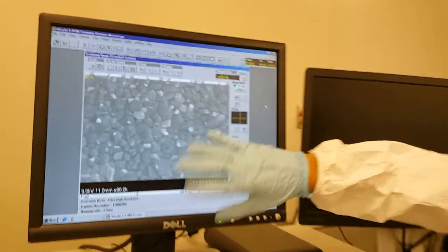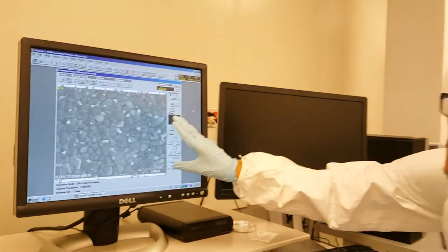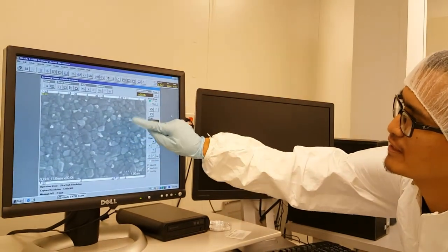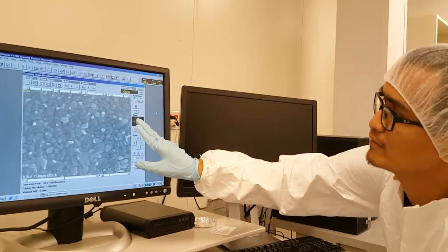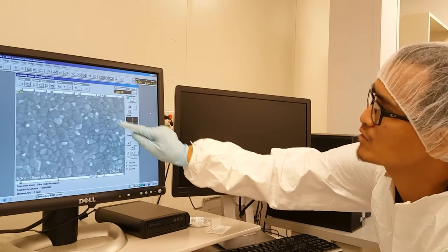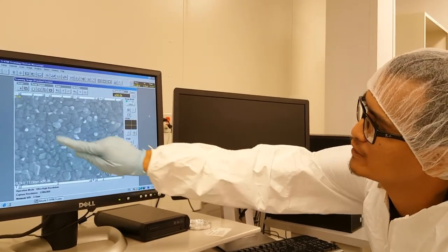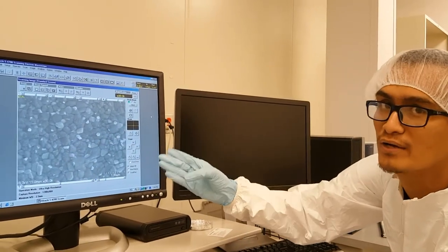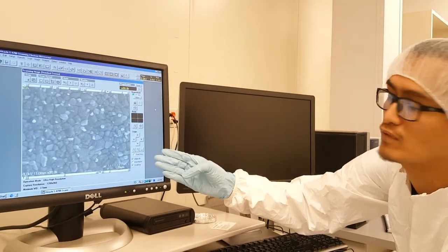So here we can see the surface of the film, its morphology. You can also see the individual grains as well and their distribution. You can also see some white spots in the film which are most likely to be unreacted or unwanted materials on the surface of the film.